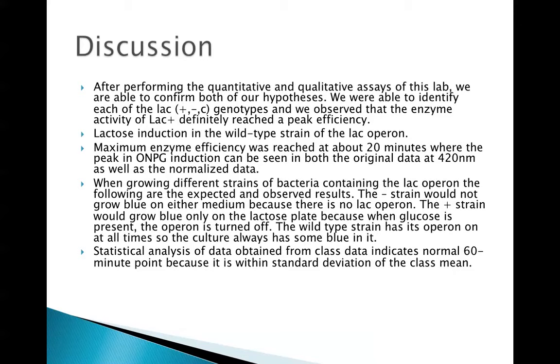We were able to find that the maximum efficiency was reached at about 20 minutes, where the peak in ONPG induction can be seen in both the original data at 420 nanometers as well as the normalized data.